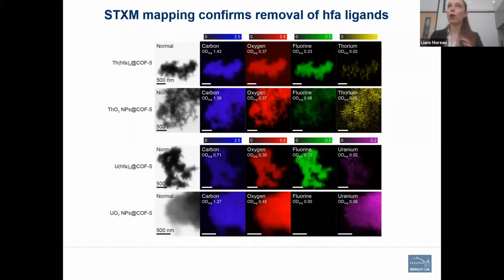some trends that suggested, or at least we attributed it to, the disorder being greater as we go outward towards the surface. There is this decrease, especially in the second shell, because the particles are so small. But it can't all be attributed to that, and we've subsequently done Debye analysis on the second shell too, and there are definitely appreciable structural disorder contributions there as well. Thank you.